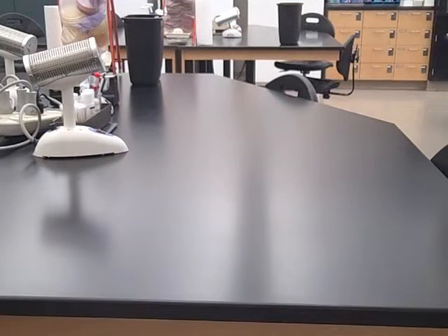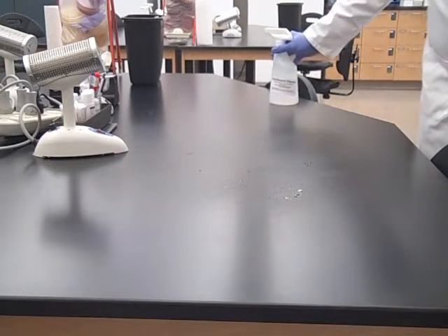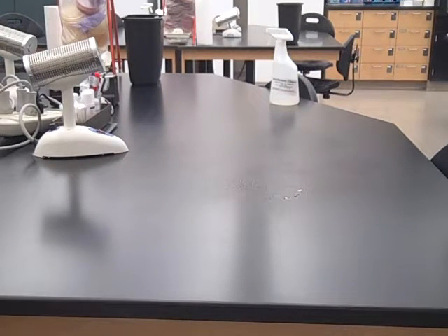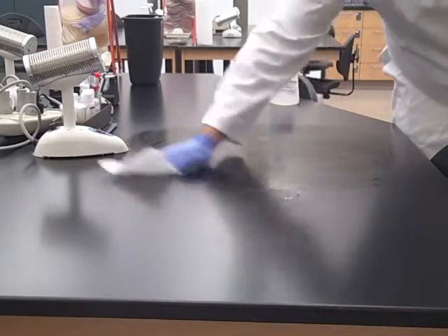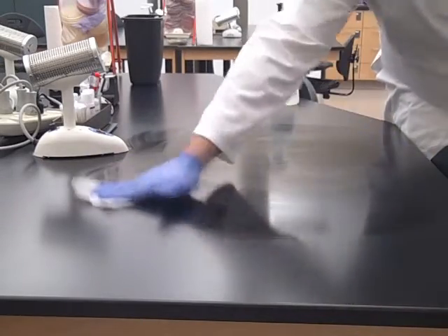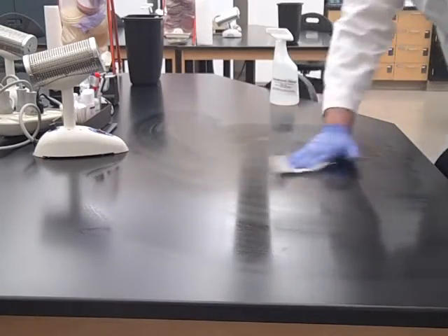You're going to disinfect your lab bench on the way into the microbiology lab and on the way out of the microbiology lab. Spray disinfectant on the lab bench and use a paper towel to wipe the disinfectant off the lab bench. This paper towel gets disposed of in the regular or black trash can.